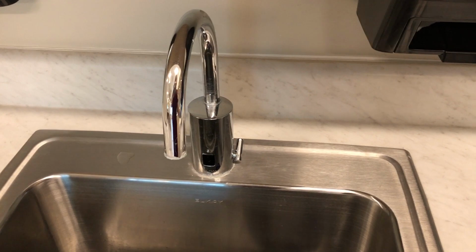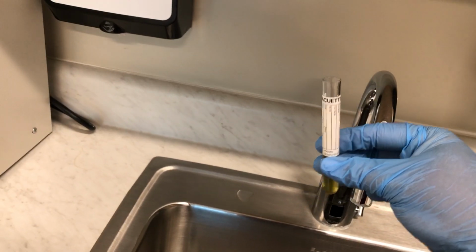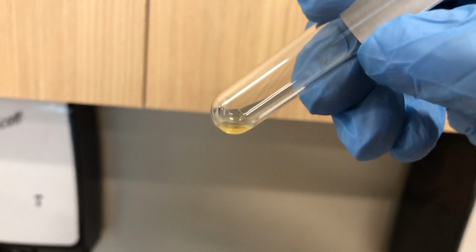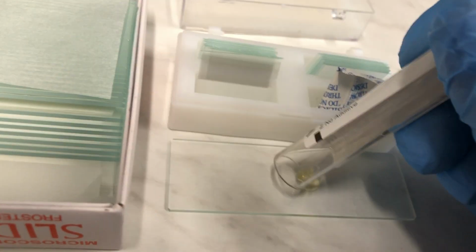So the next step is to take our tube, and you can do this with a pipette, but I like to do it the quick way, which is you take your tube and just turn it over and invert it. Just like that. You don't need to shake it or anything. And then turn it back around. You'll see that there's still a drop of liquid in there, and the sediment is stuck to the bottom of the tube, so it didn't run out when I turned it over. So now all I have to do is tap it 1 or 2 or 3 times on the counter to knock it loose. And then I pour it out onto my microscope slide.